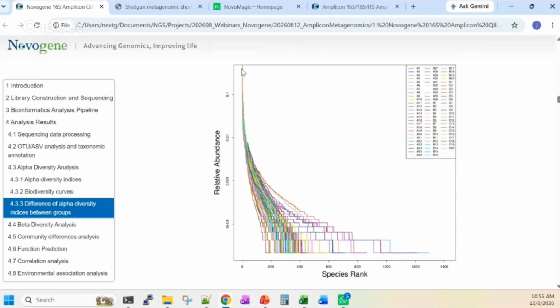If we see one very dominant species, while the rest are only rare, low-abundance species, then we should see the line drop very quickly, vertically over here, and then move sideways at the bottom of the graph.